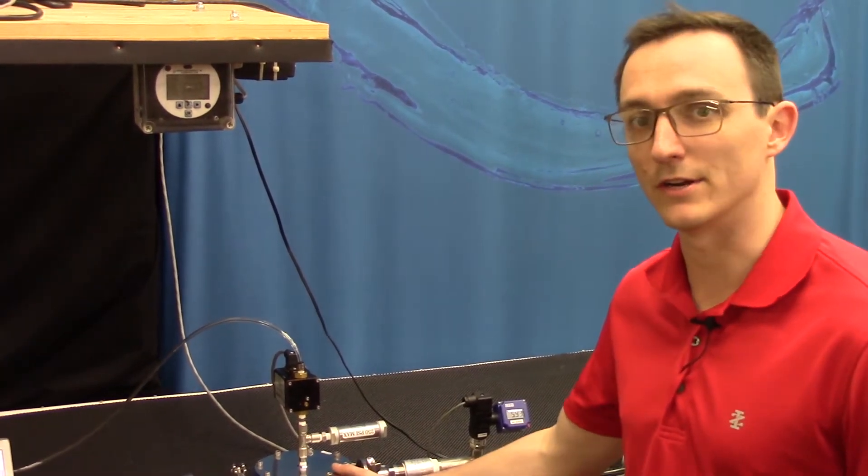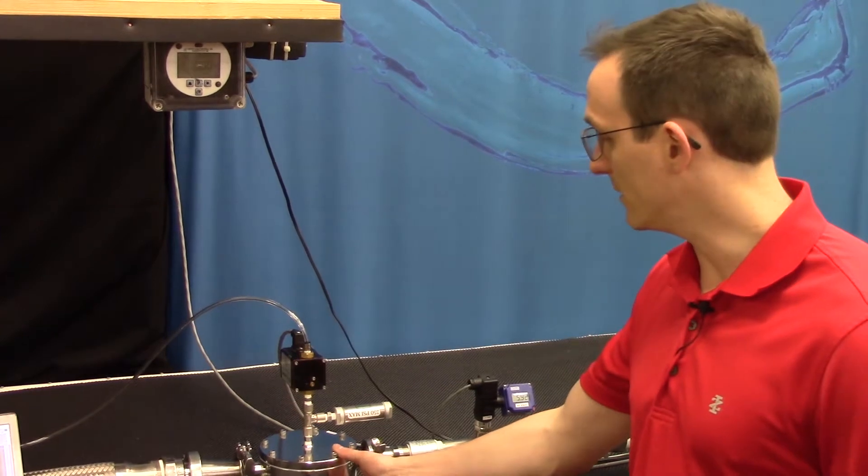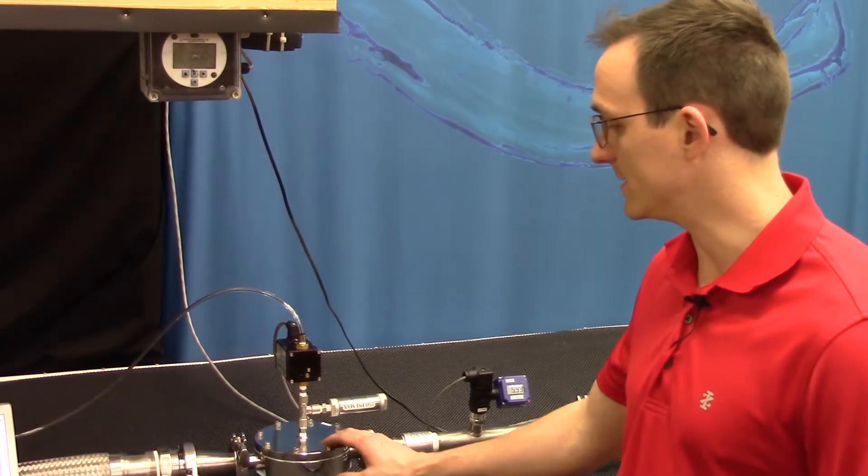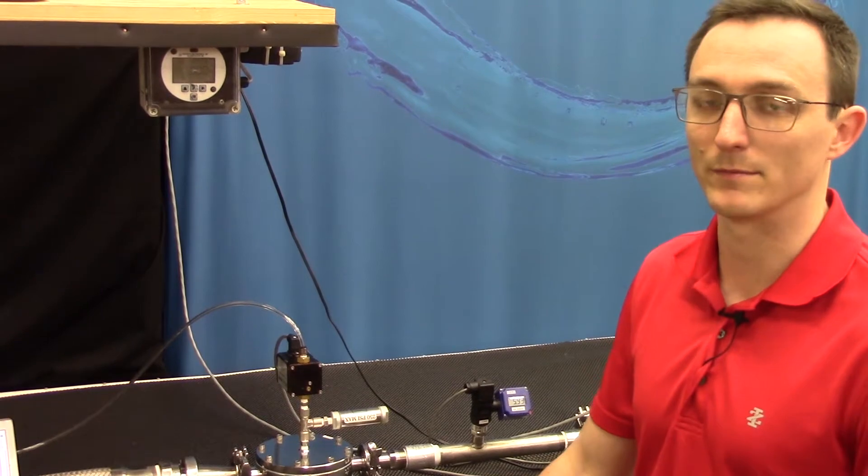Hi, my name is Ryan Hefner, and today we're going to demonstrate the high turndown ratio of the Equilibar FD08 back pressure regulator, which is part of our FD series for biopharma and pharmaceutical processes.